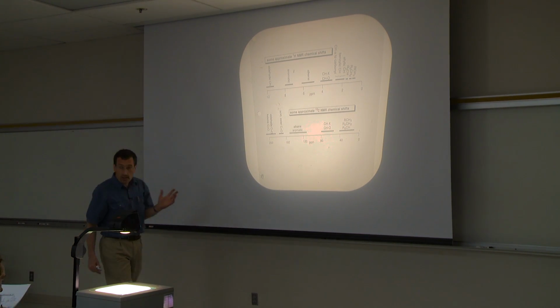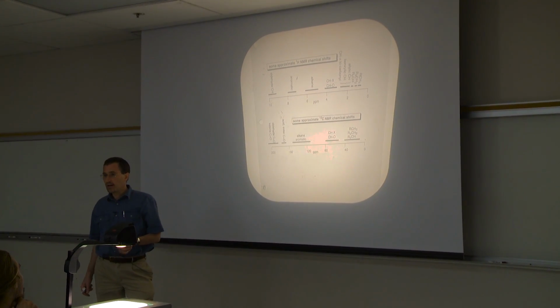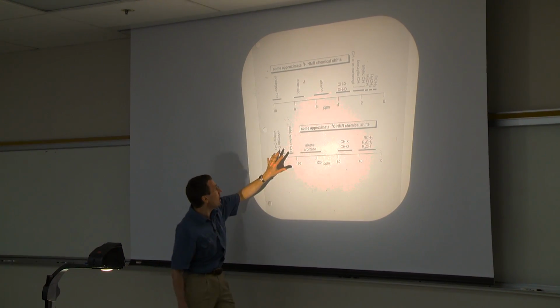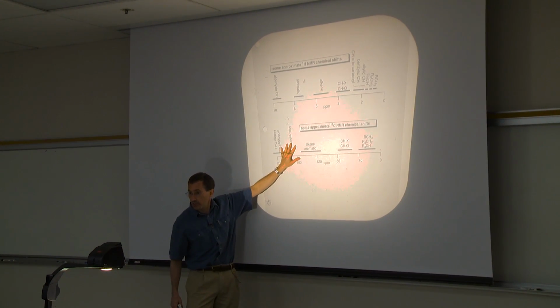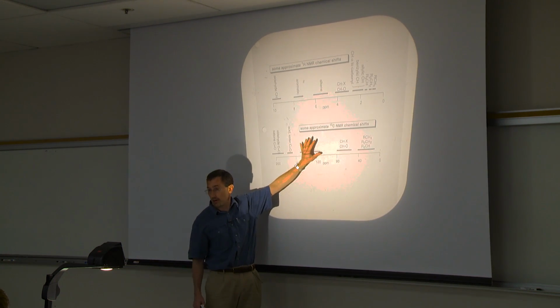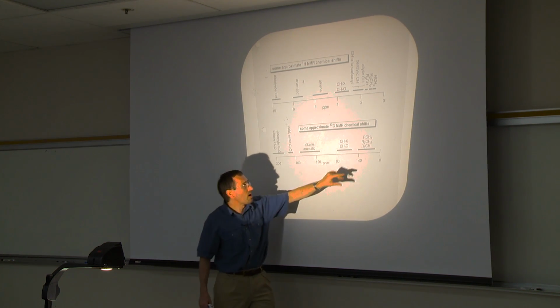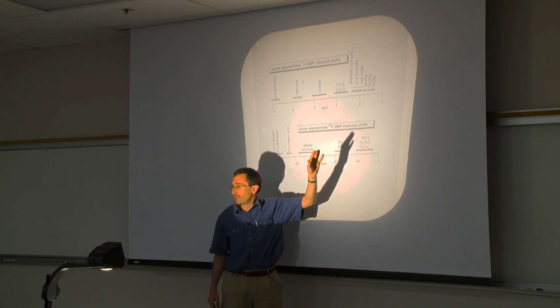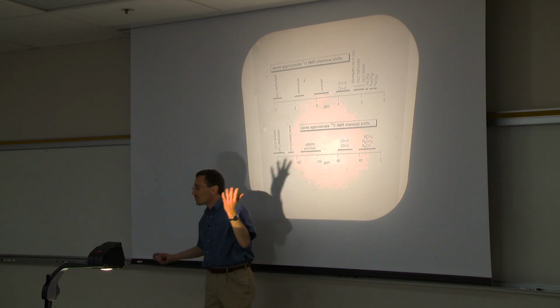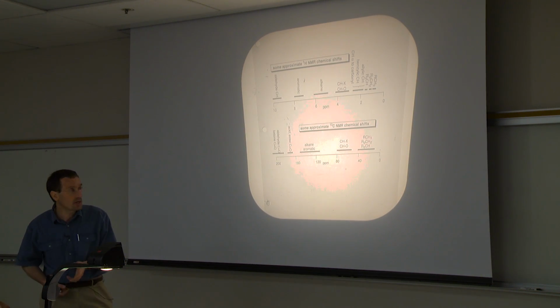But when I look at a spectrum, typically I am reading the spectrum. In other words, I'm looking at the range of the spectrum and saying, oh, there's a peak over here. There's a carbonyl peak. It's probably an ester. Or there are some peaks over here. They're probably some alkene or aromatic. Or, of course, there's a bunch of alkyl stuff. Many molecules have it. Or, oh, there's a peak over here at 63 parts per million. I probably have a carbon attached to an oxygen atom.